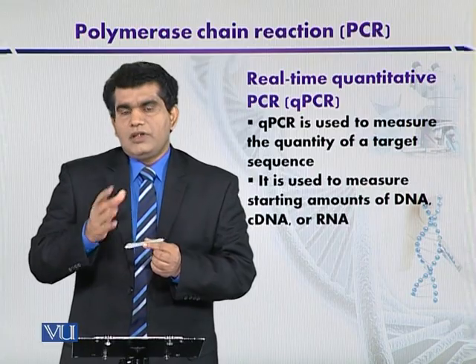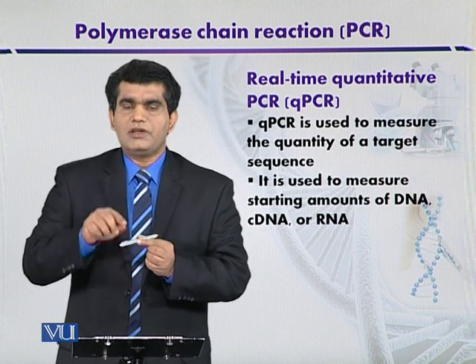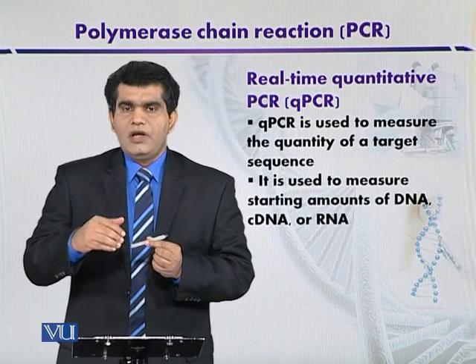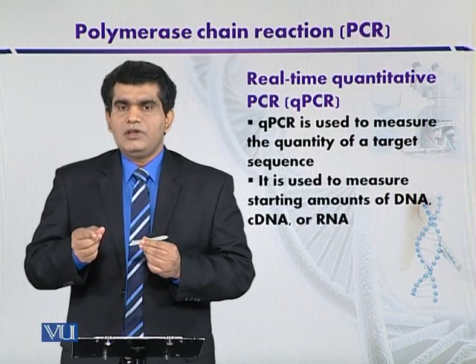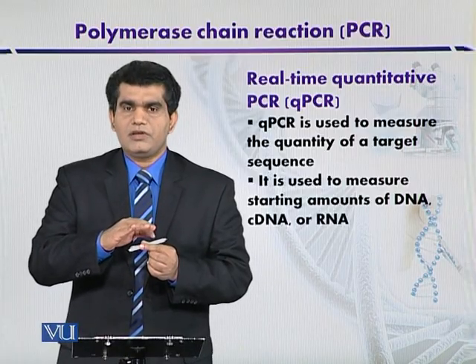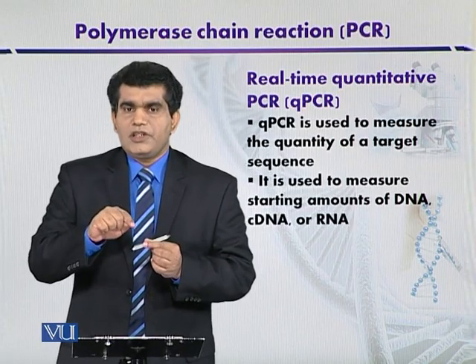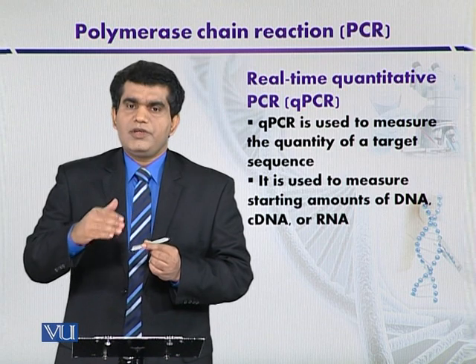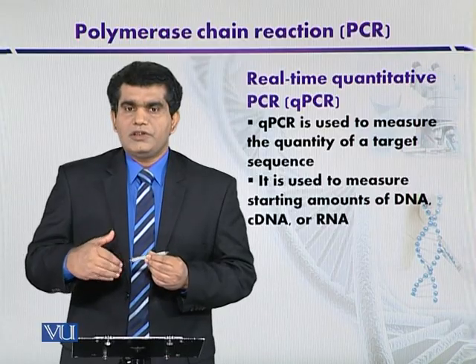When Taq polymerase starts its amplification, the fluorescent dye is cleaved. As soon as it is cleaved, it will record a fluorescence. And with the subsequent amplification, this probe is also removed. Now the quencher is not in the vicinity of the fluorescent dye. So the fluorescent dye, after cleaving because of the nuclease activity of the Taq DNA polymerase, is removed, and it will record the amplification after each PCR cycle. So in this way, the more the fluorescence, the more the accumulated DNA concentration.